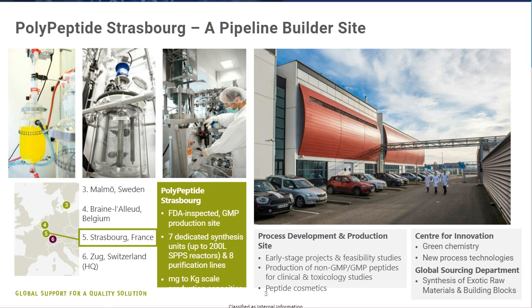because of maybe some other people watching, but for instance, we are working on trying to find other types of solvent to replace DMF, or mixtures that might be used instead of it to perform our couplings or our washing.